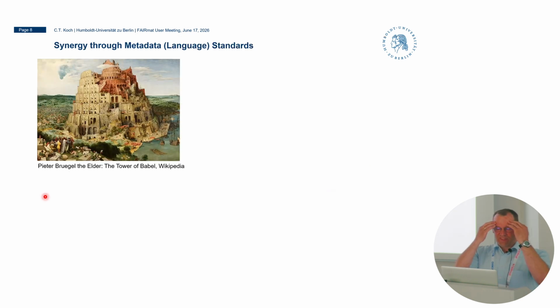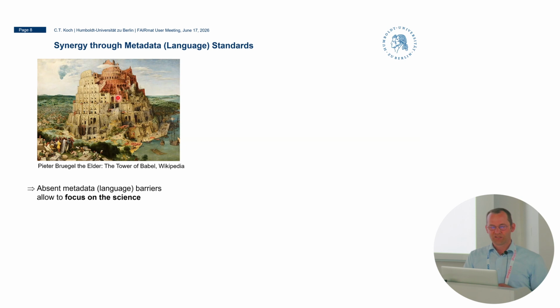So maybe you've heard about the story, this old story where people were building this tower, and then all of a sudden they started speaking different languages, and they had to stop the project because they couldn't collaborate anymore. And this is really where I think we need to define common metadata standards. If we don't have common metadata standards, it really makes it difficult, and there's a lot of information lost in translation between different techniques.